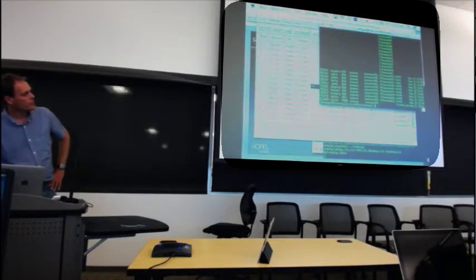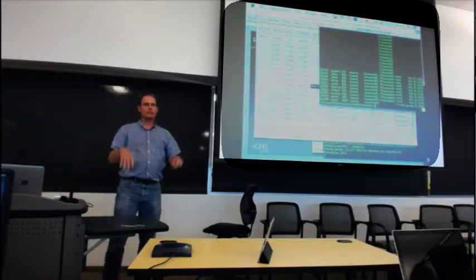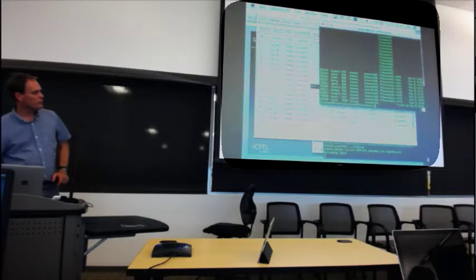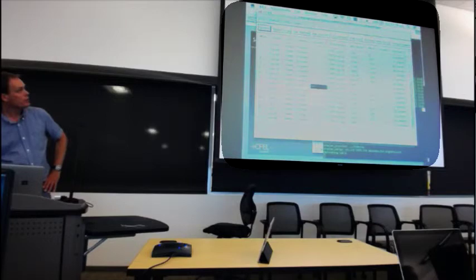Okay, everyone, I can see quite a few people here have got it running already. Someone's run 1.2, and a bunch of people here are running 1.9. All of these are running in parallel on the data. Normally you try not to do this, you just have one process in the data, but this is great for the tutorial. So if your jobs are appearing in here, and that's just this command, then you know things are working.